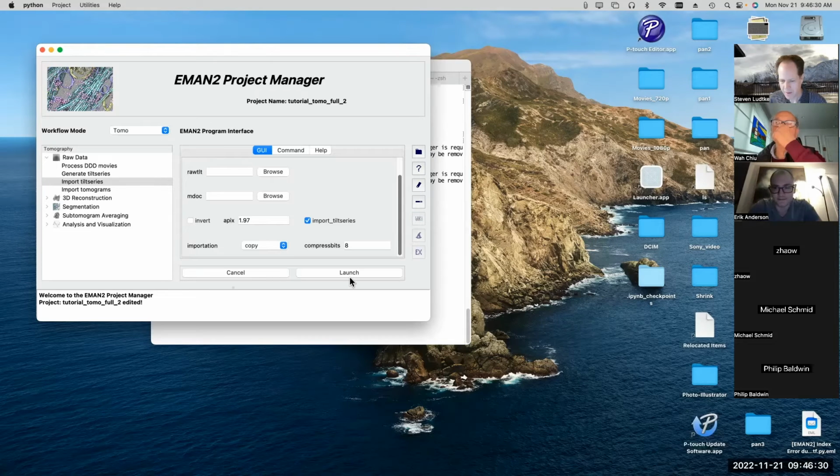And it's even more confusing, right? If you do give it the MDoc file and it does sort them in the wrong order, the tomographic reconstruction will still kind of succeed. It'll just be completely wrong. So then you get this reconstruction and it'll look really funny and you won't know what's going on. You say, oh, it kind of failed or something. If you see a failure in the 3D reconstruction, usually it's because you got the tilt series messed up.